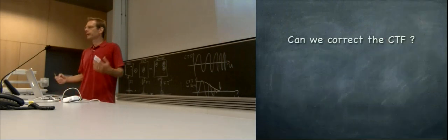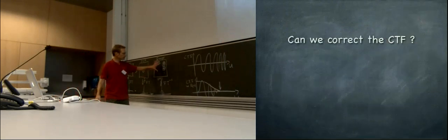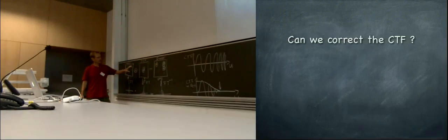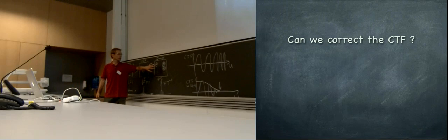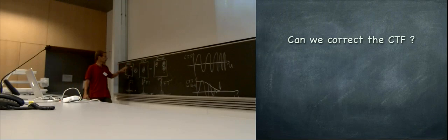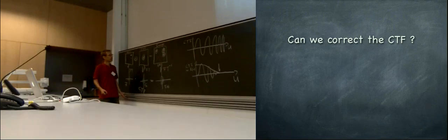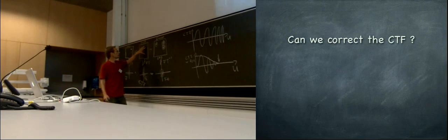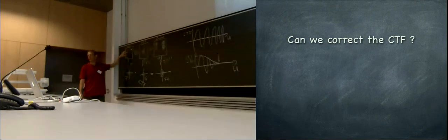So, why is this all important? It's important because this is not how our atoms look like. We want this, but we have only this in the beginning. And now we have to get rid of this point spread function to do this. And this is what the computer image processing has to do. Yeah? So we record our picture, and then we want to deconvolute our point spread function out so that we have a map of the atoms.